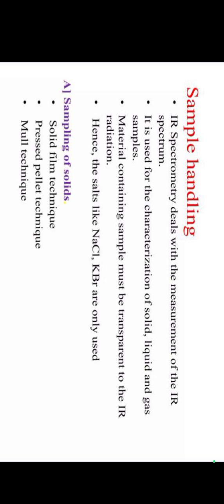The sample handling is divided into three: sampling of solids, sampling of liquids, sampling of gases. First, for sampling of solids, there are three techniques: solid film technique, pressed pellet technique, and mull technique.